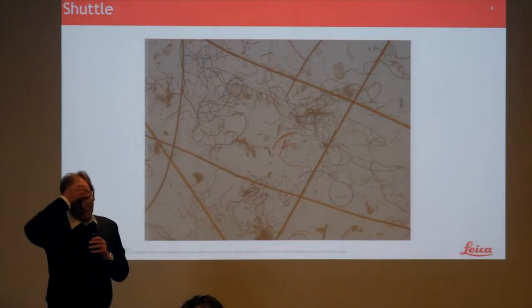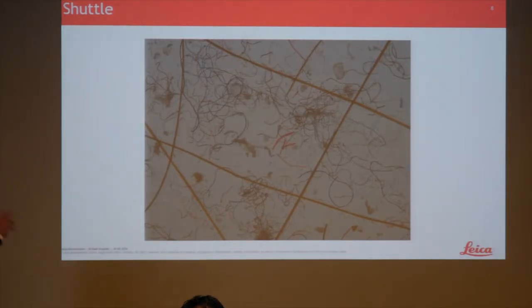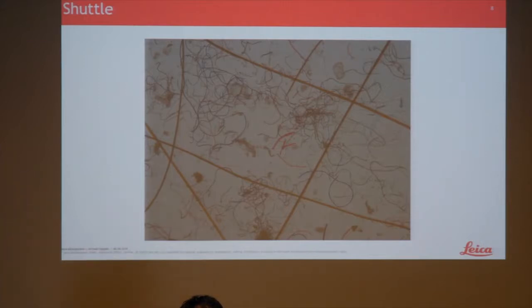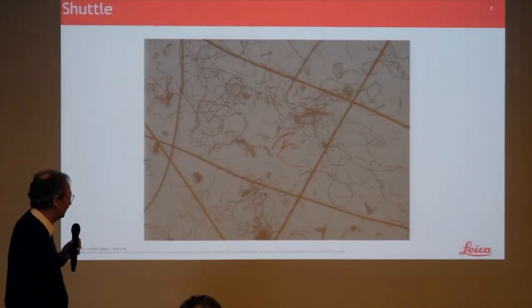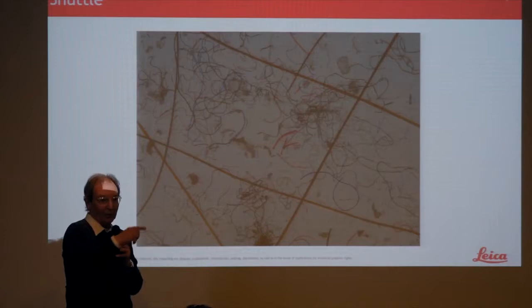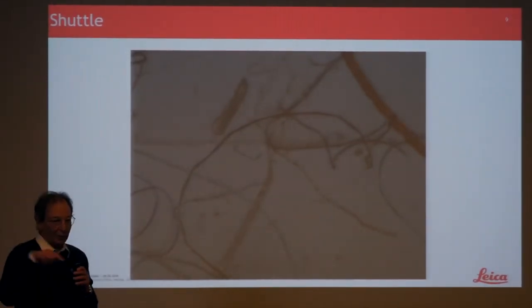Okay, let's come to some pictures. Actually, that is part of my carpet at home. Inner tape, and then I actually use the DVM-6 for that. And that's already a scan. And scan dimensions, if I remember well, is something like 6-7 centimeters times 4 centimeters or so. That is relatively fast, but that's not at your requested resolution. So that would be one single image out of that XY scan.